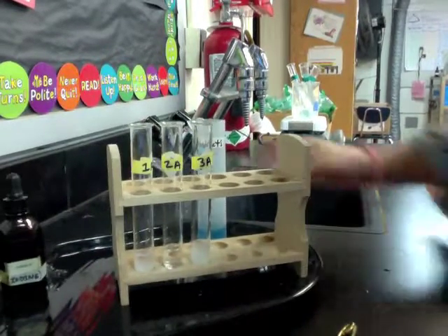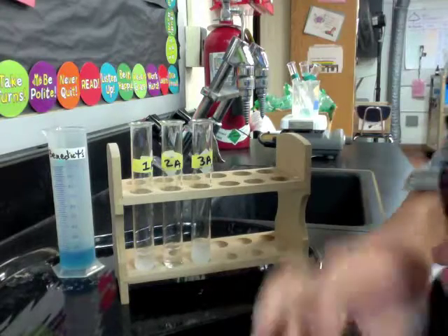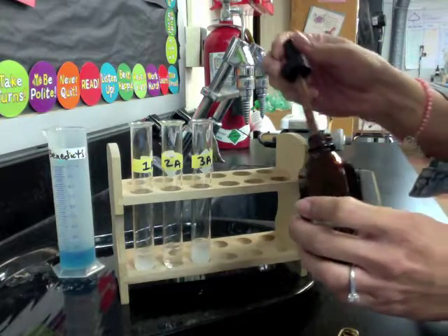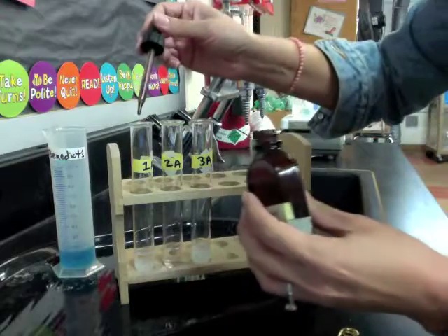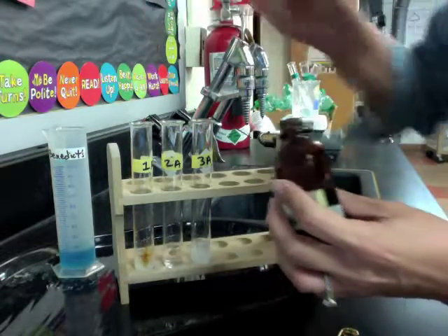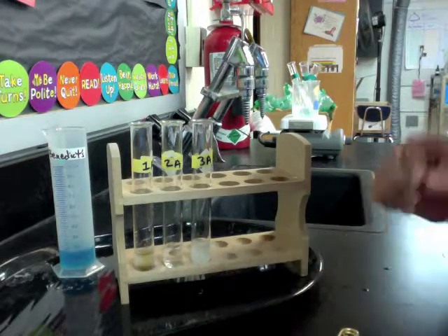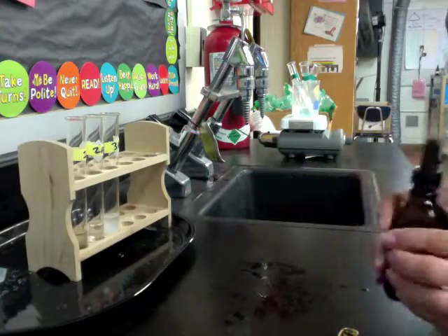The other three test tubes we're going to test with iodine. So we're going to take the iodine and place a few drops in each of these, and we're going to notice any color change. When you see the color change, you're going to make observations and record those in your data table.